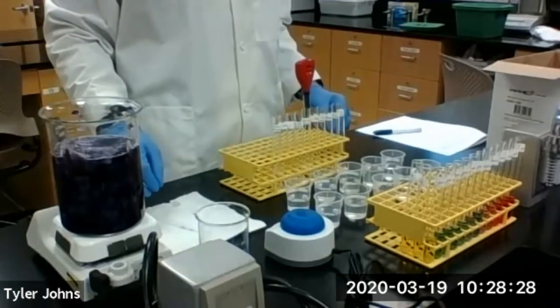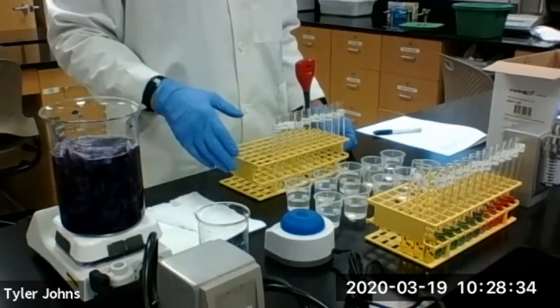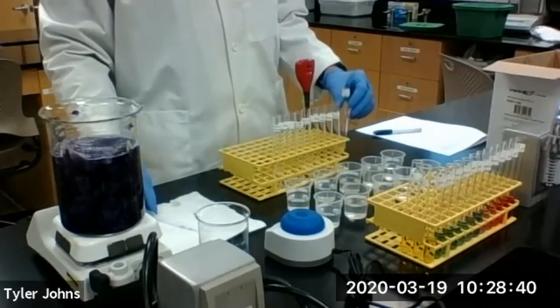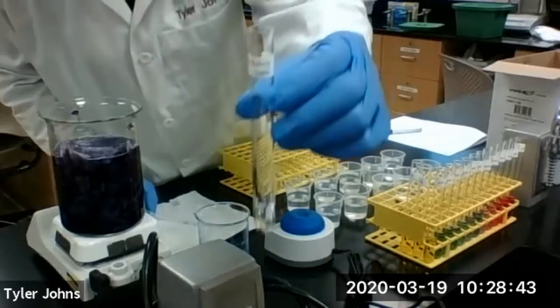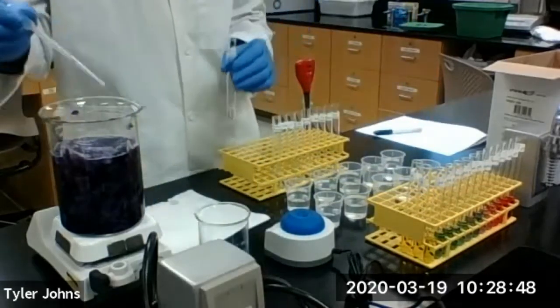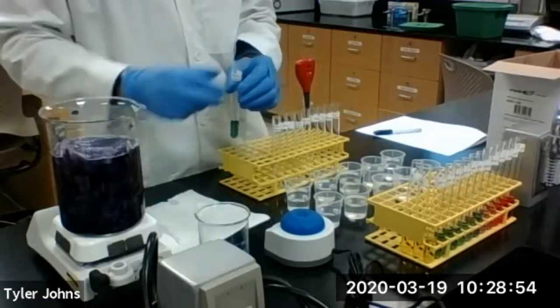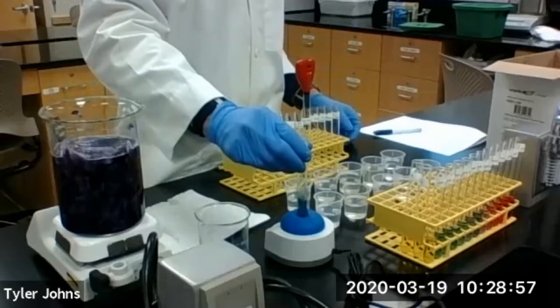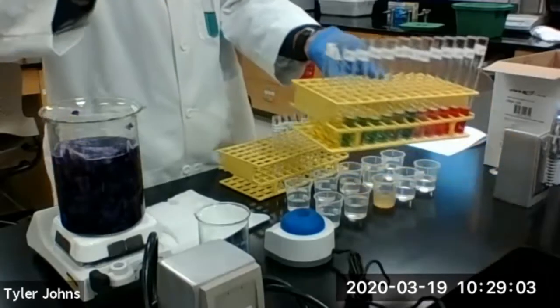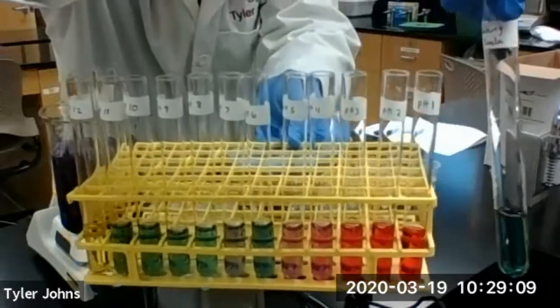Okay, class, we are now going to use our cabbage juice indicator references to test several household substances. So we're going to start with 10% baking soda in solution. We're going to add our cabbage juice indicator. Mix. And then we will compare to our standard reference solutions to see what pH the 10% baking soda is.